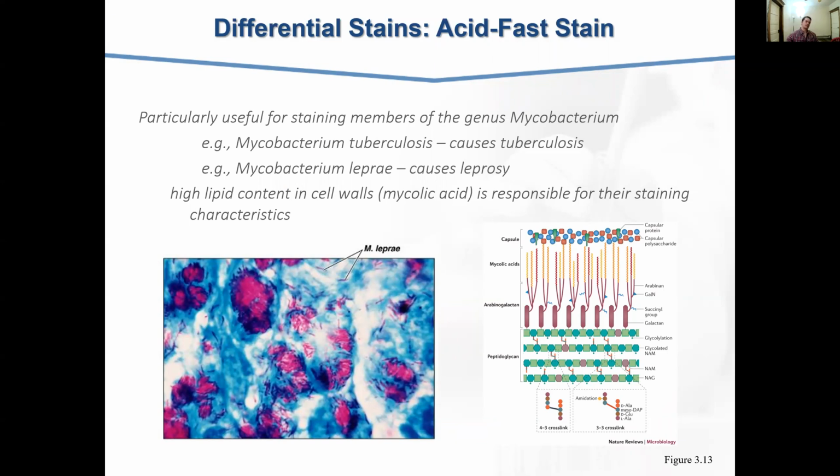So what are acid-fast organisms? Essentially, an acid-fast organism is characterized by wax-like, nearly impermeable cell walls. They contain mycolic acid and large amounts of fatty acids, waxes, and complex lipids. Acid-fast organisms are highly resistant to disinfectants and dry conditions. And because their cell wall is so resistant to most compounds, they require a special staining technique.